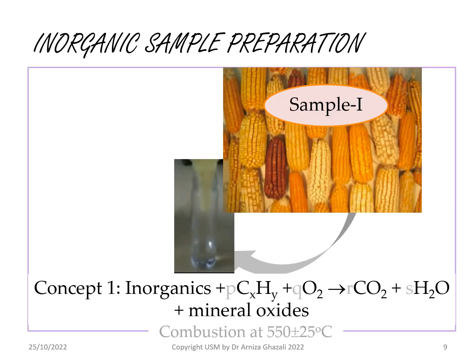Look at the instrument, but before that, this is another example of sample that we can liquefy in order to get liquid. Okay, I have uploaded the video at Open Learning site. Okay, please access the site to look at how this instrument called sample digester looks like.